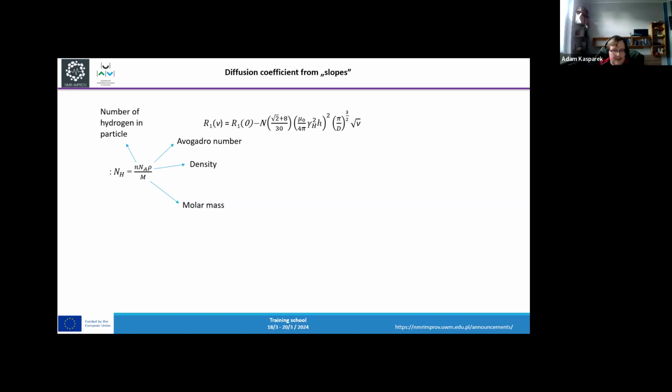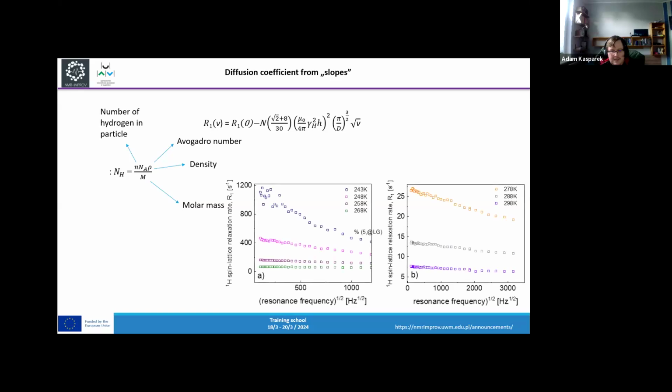And frankly, when we have this result, the diffusion can be calculated, approximated, from such a result like here, and from such a formula like here. So let's try to do it.